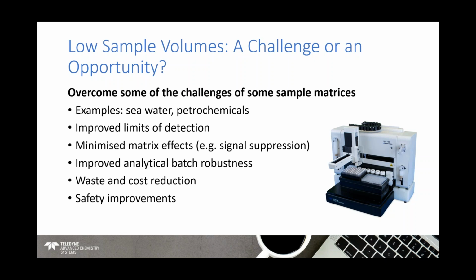The same can be said of seawater. This is something else that we've seen as well. A concentrated seawater introduced to an ICP-MS with a marginal dilution for adding an internal standard, teed-in internal standard flow, we've actually seen minimized signal suppression from the salt in seawater. So there are considerable advantages for some sample types to going to this low volume, low flow rate approach.